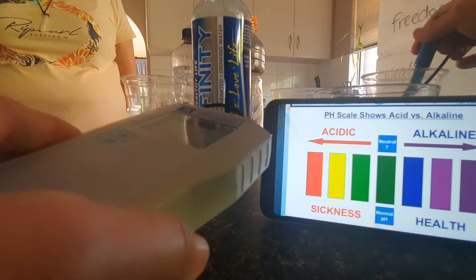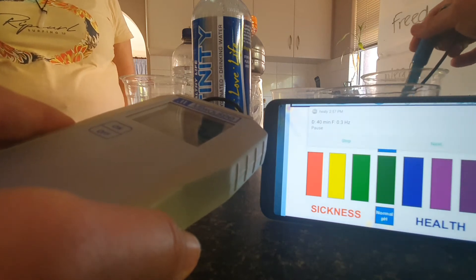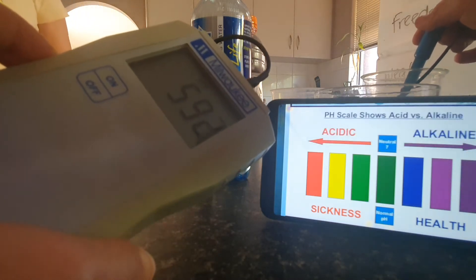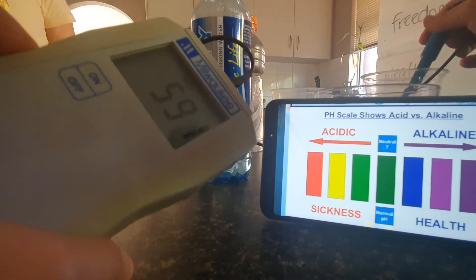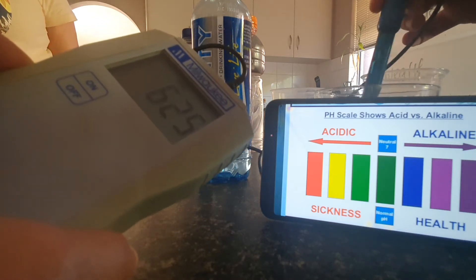Then we've got the tap water, which is close to 600 — it's shot up to 600. So there's no positive nutrient in tap water in Perth. We're in Greenwood. There's no positive nutrient in the tap water, which is kind of scary if you ask me.